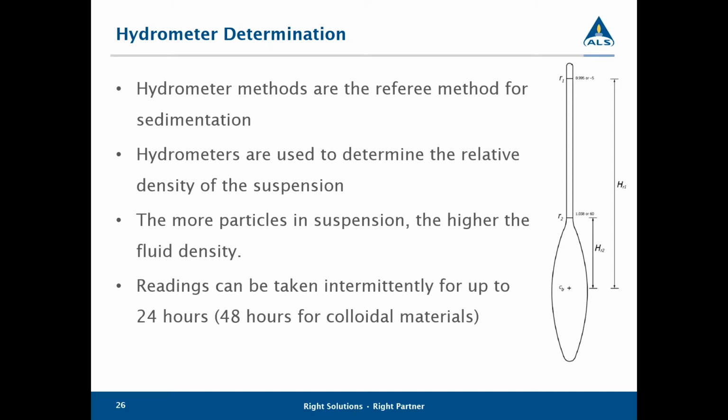We also, by taking the time, can then determine what the actual settling rate is of the solution and the particles in there, and know how many of the particles, or the maximum size of the particle, that's still in the solution. We typically take our readings intermittently for up to 24 hours. We can extend that to a 48-hour reading as well if colloidal materials are also important.